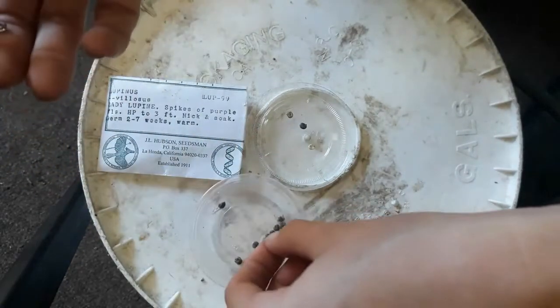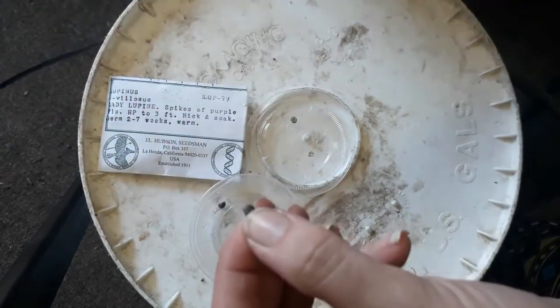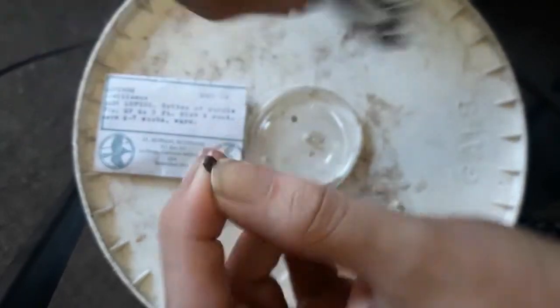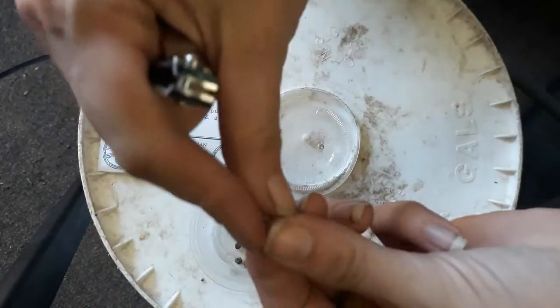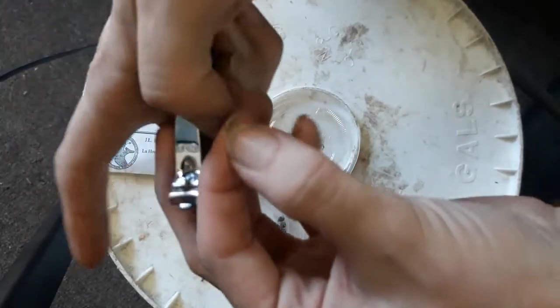There we go, we just clipped off that end. I'm going to do 20 of these. I have a few extras because sometimes you will end up clipping a little too far and then your seed might split in half. When we plant them we will just plant 20 seeds that will be soaked and 20 that will be not soaked.